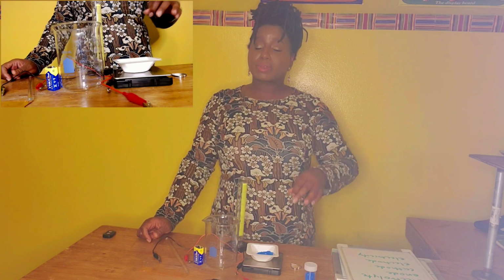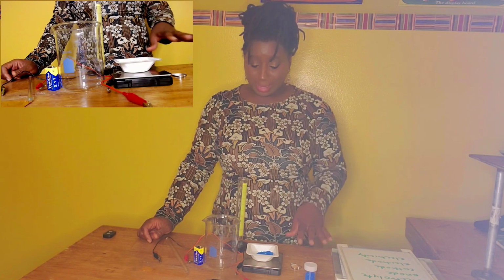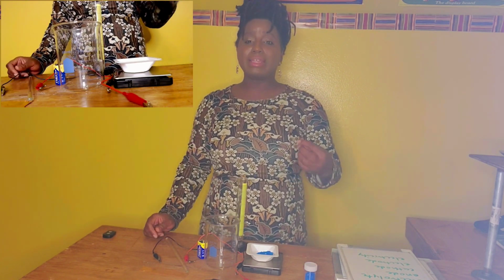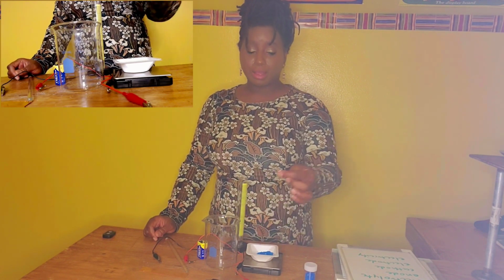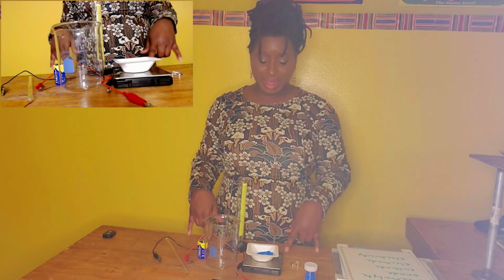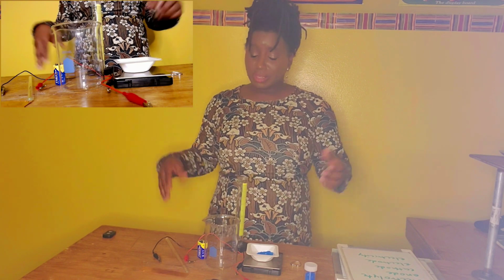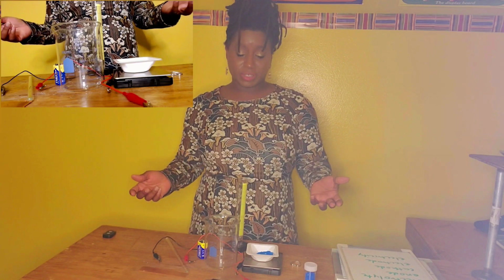You can purchase copper sulfate at your local hardware stores such as Home Depot or Lowe's. Yes, absolutely. You will also need a 9-volt battery and something to electroplate on. All right. We're going to be using a heart-shaped pendant. I'm super excited, you guys. So those are about all the materials you will need for this lab, other than a digital scale or triple beam balance to measure out the 10 grams of copper sulfate. So now that we've gone through the items that you'll need for the lab, let's go ahead and get started.